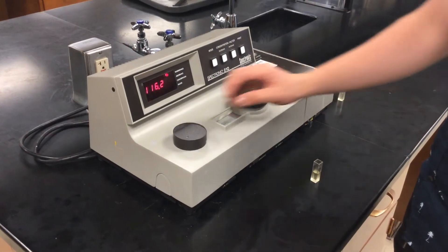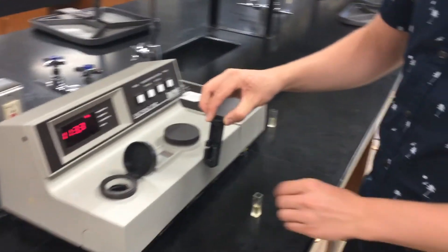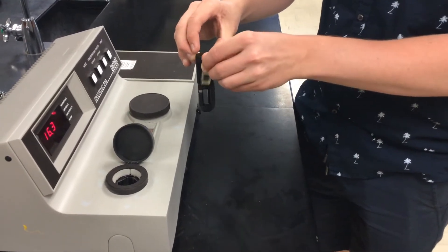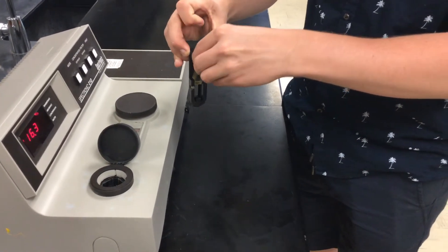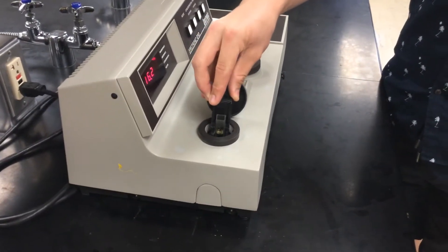Now we will insert our blank cuvette. Make sure that your blank cuvette is filled with your blank solution and it's two-thirds full. Insert the blank cuvette into the sample compartment so that the proper direction is facing the right way, and gently press it down into the compartment.